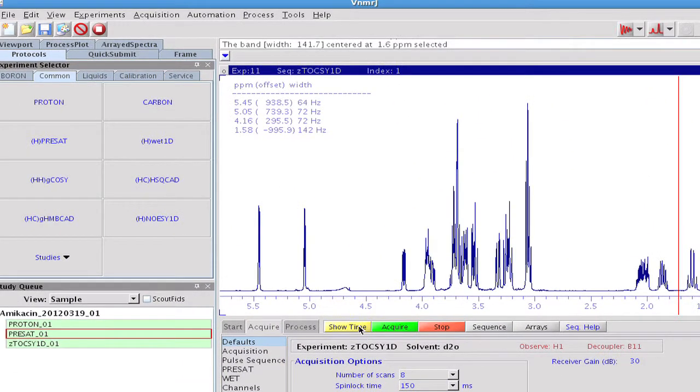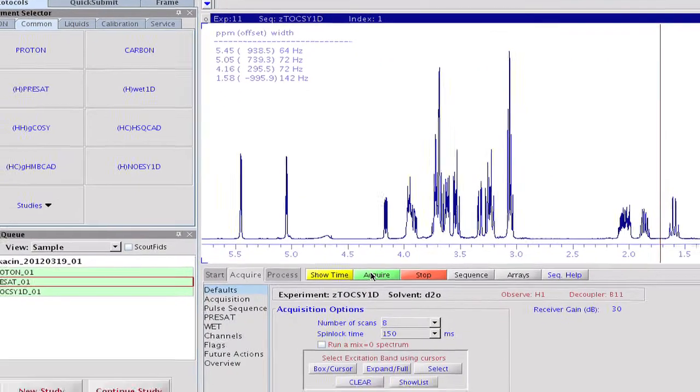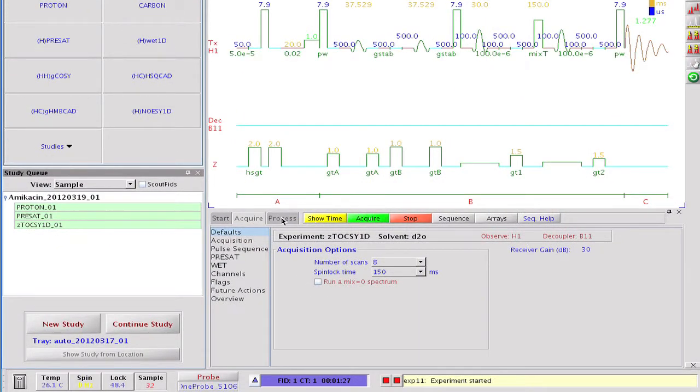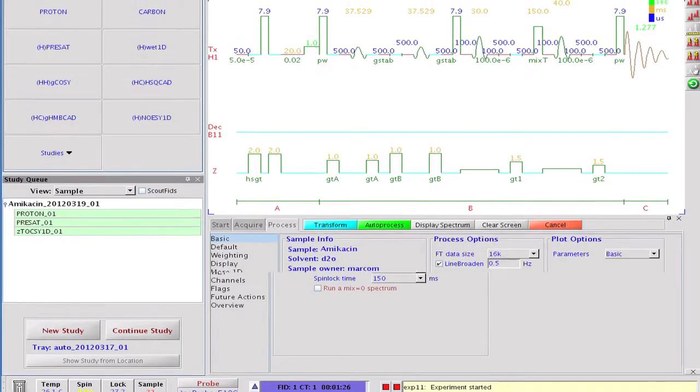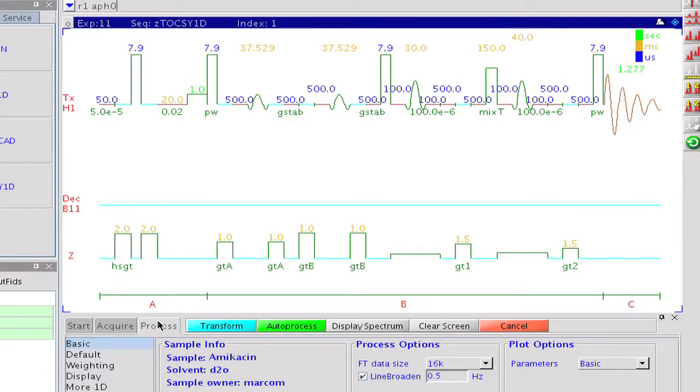Using the current parameters, the total experiment time is about one and a half minutes. When we click the acquire button, all requested shape files are created by Pandora's box, Agilent's powerful pulse shaping engine. The relevant parameters are updated and the four data sets are arrayed before data acquisition begins.